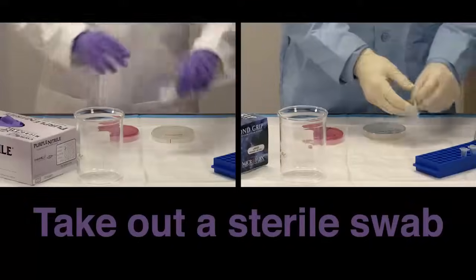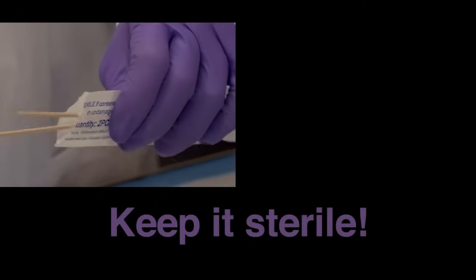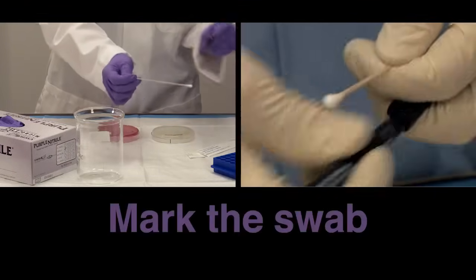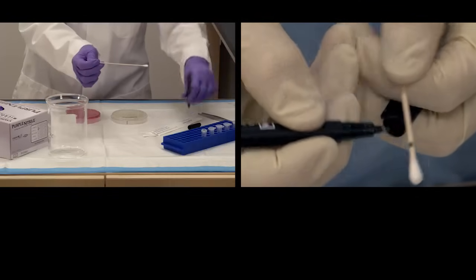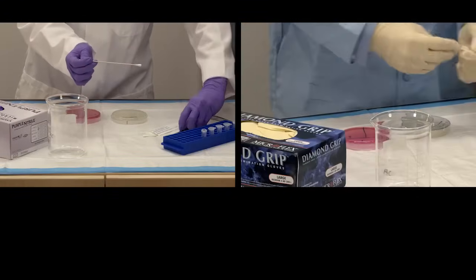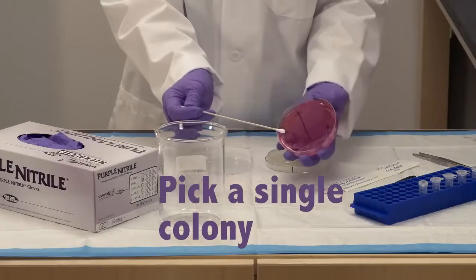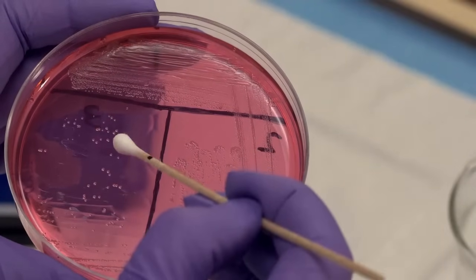Take out a sterile swab. It's important not to contaminate the cotton tip. Draw a black dot next to the tip. This will help you locate which side of the cotton swab is inoculated with bacteria. Find a single colony to pick. Make sure you can see the black dot when picking the colony.